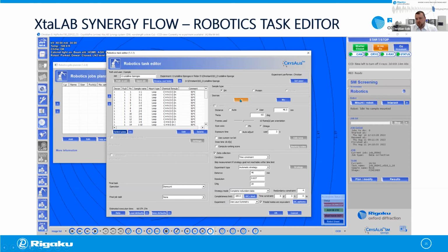You can choose which wavelengths you want to use, of course. You could also mix and match between the robotic tasks, of course. Yeah, for the sample screening, you have a detector distance, an offset for the detector, how many frames should be used for the orientation matrix determination, exposure time, and so on.